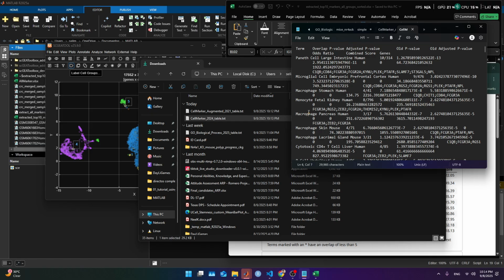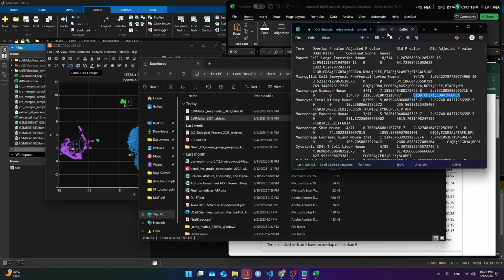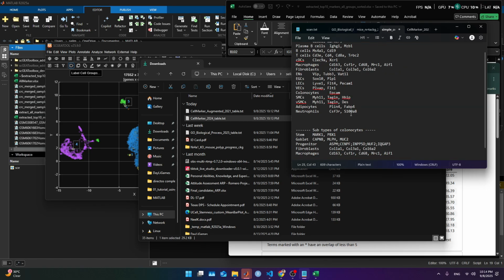So we look for macrophages, stomach human. We bring this set and copy-paste here. Back, close that. Here, we are going to replace that. And we are gonna do one thing after just to verify.